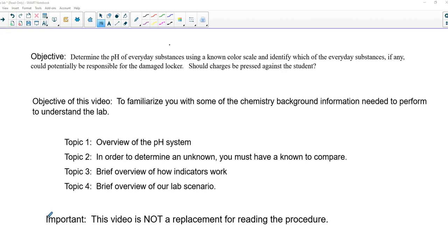I'll cover 4 topics in this video. 1, an overview of the pH system. 2, in order to determine an unknown, you must have a known to compare. How do we determine an unknown? 3, a brief overview of how indicators work. 4, a brief overview of our lab scenario.